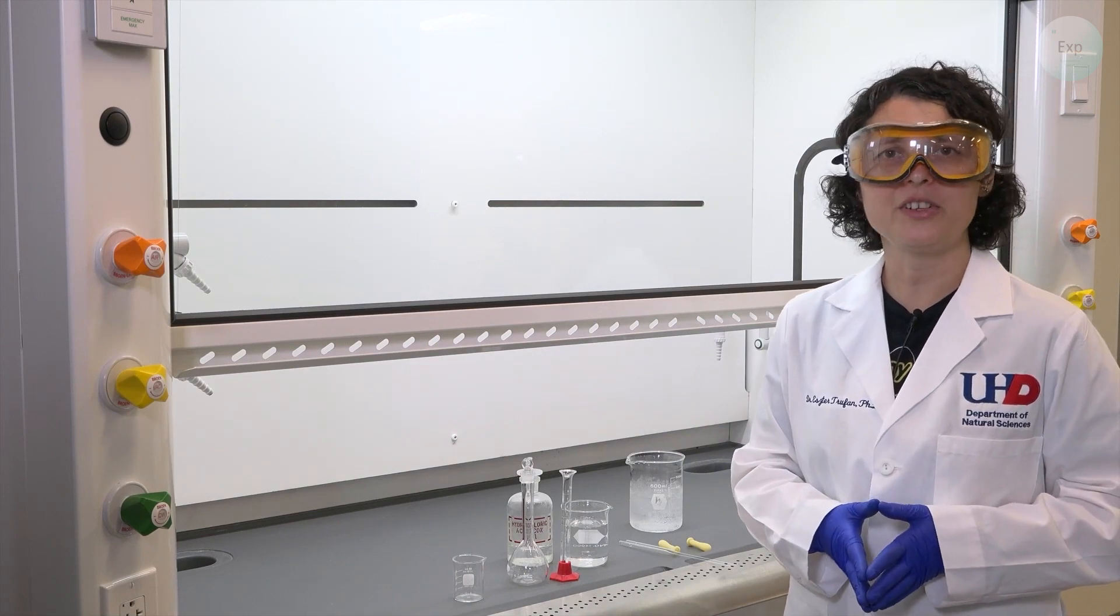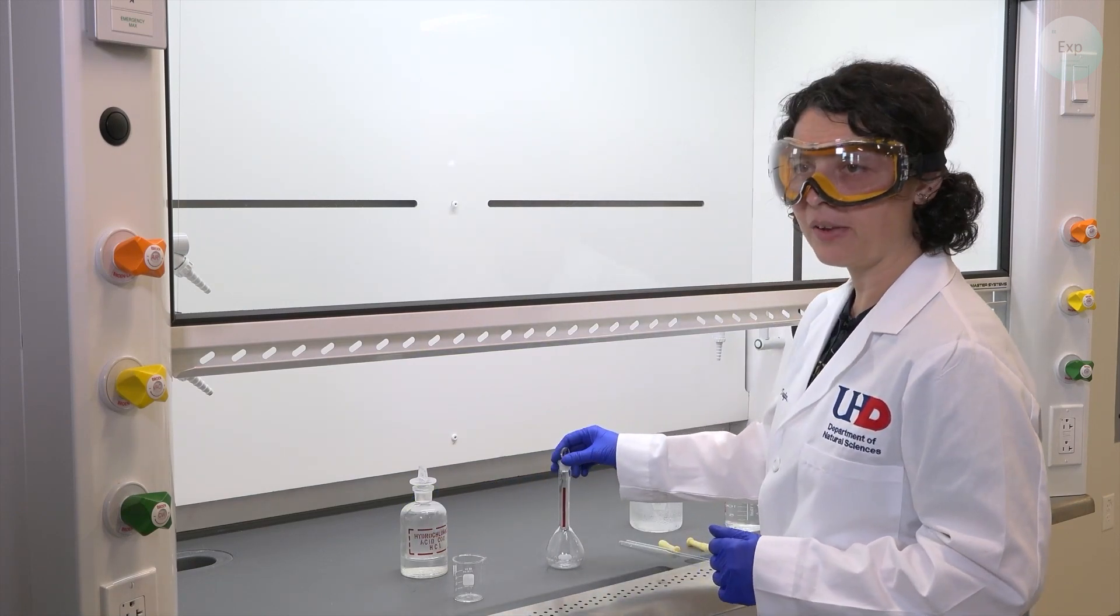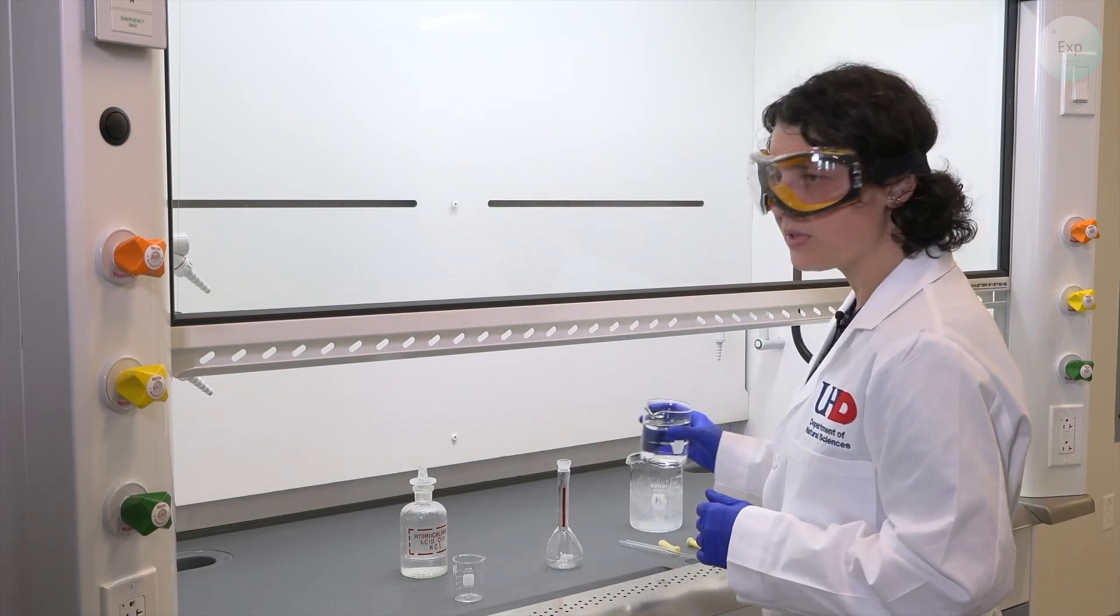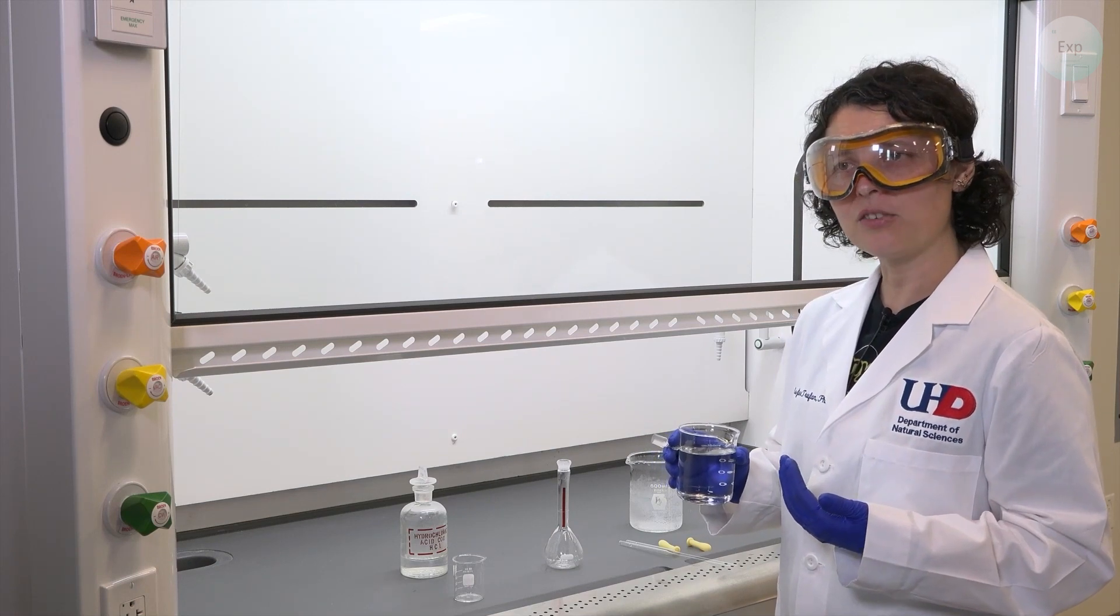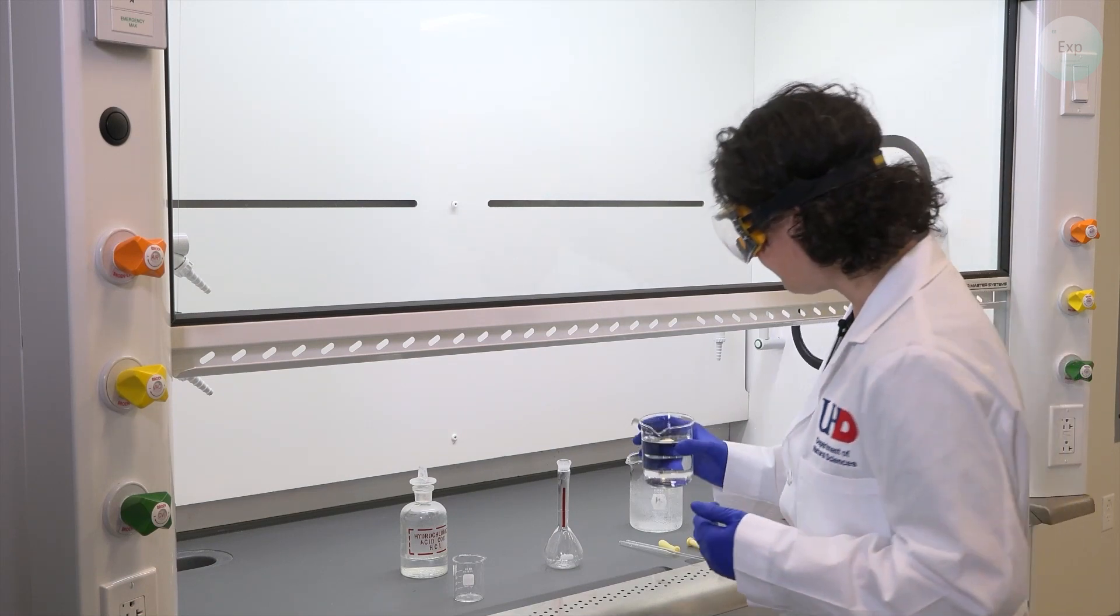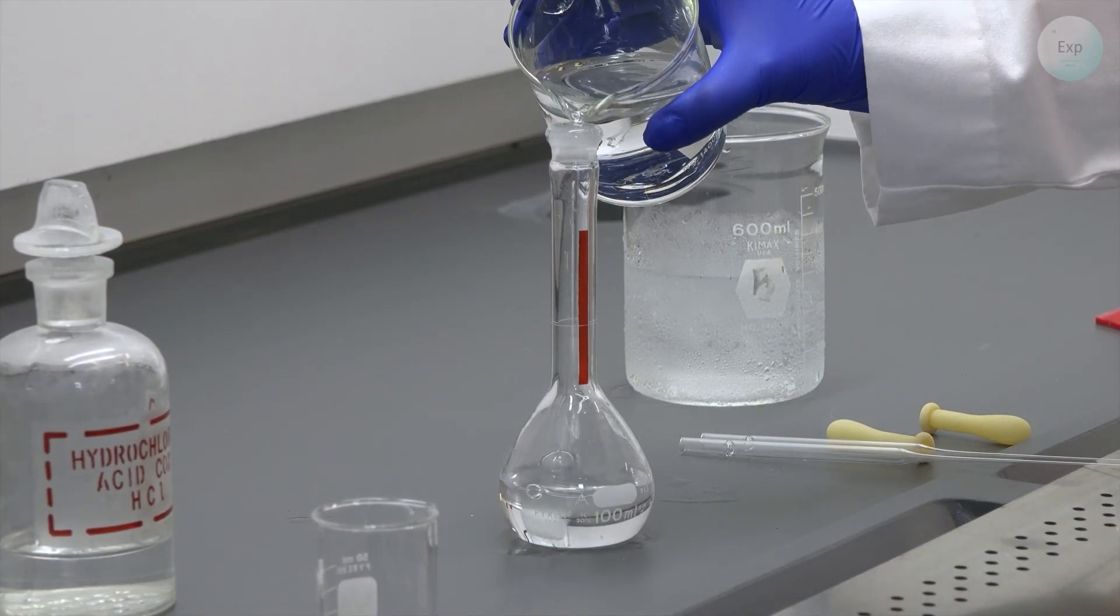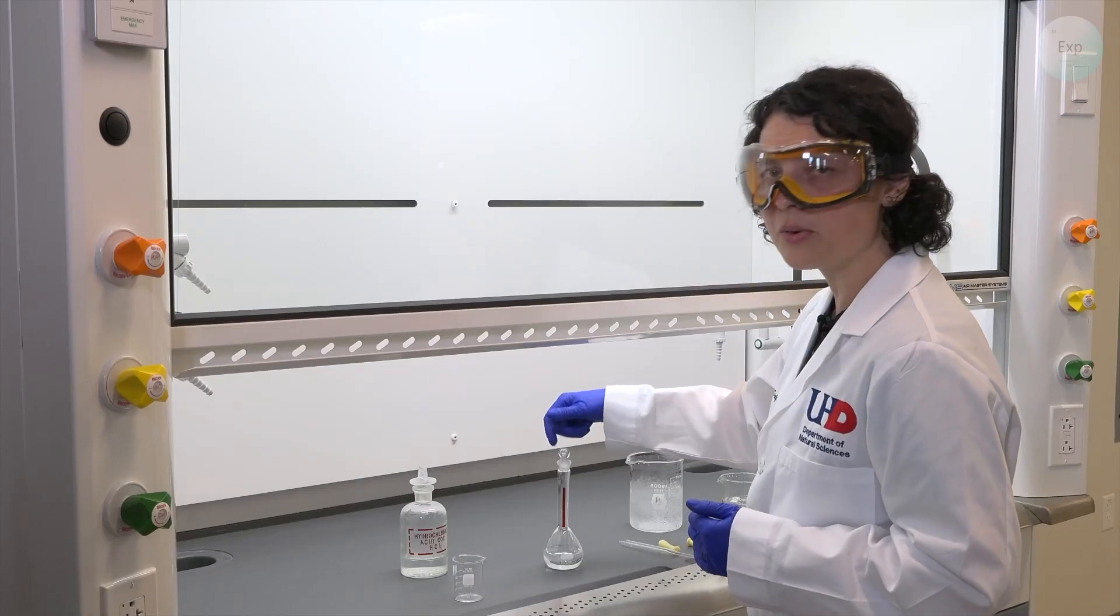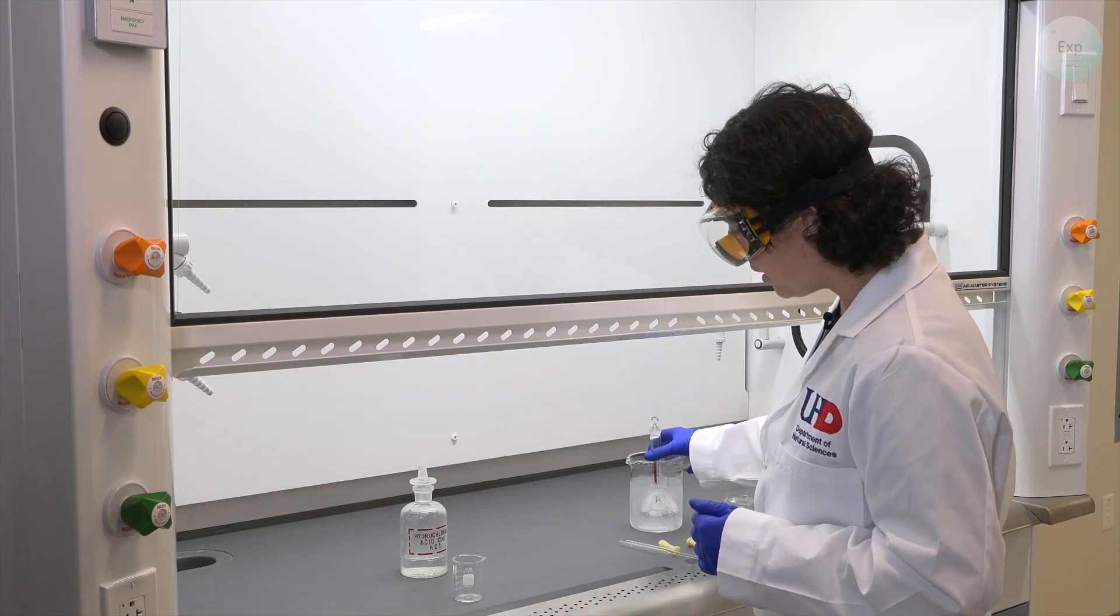Now that we have all our equipment and materials, let's get started with the process. The first thing we're going to do is fill about halfway our volumetric flask with deionized water. We can always use a 50 milliliter graduated cylinder to do a more accurate volume addition, but we can just eyeball it. We can put the cap back in so it does not get contaminated and then transfer our volumetric flask inside our ice bath.